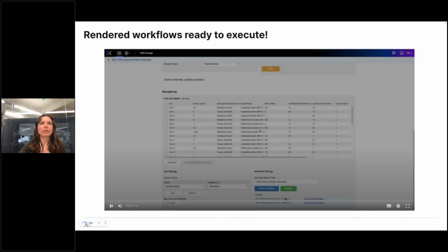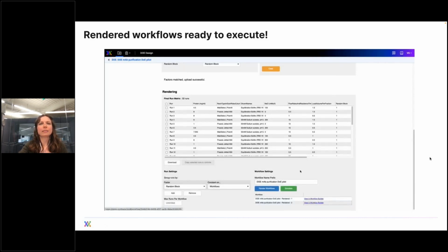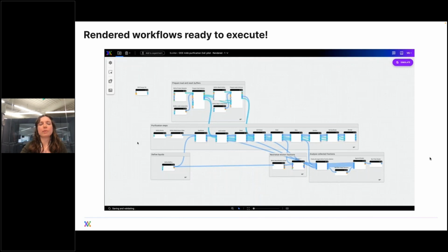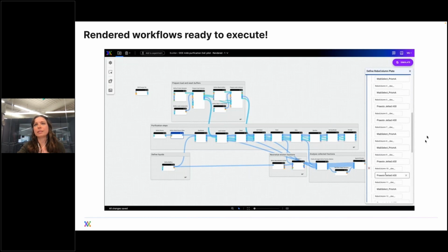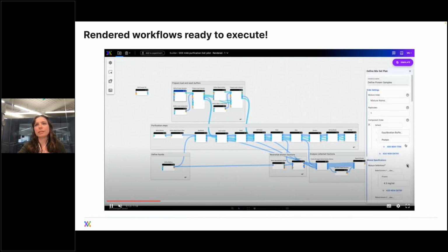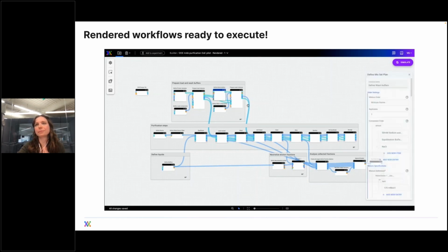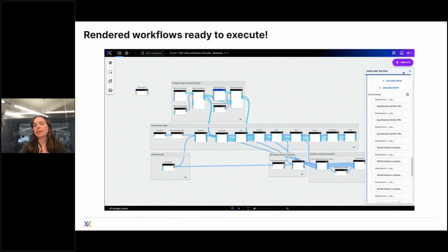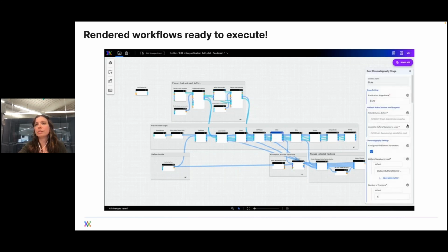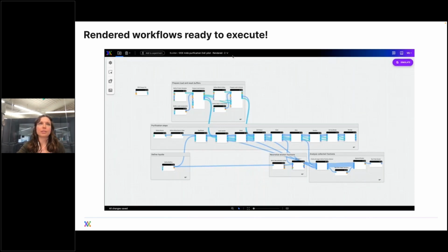And so here I'll quickly showcase how this looks. So again, we get taken to the builder and you see the workflow looks exactly the same, but now you can see that all the parameters are automatically filled in. So you didn't have to do this manually. Synthace imported this from the design file. And that there, it's basically columns 1 all the way through to 16. And we're highlighting here the different stages that we decided to DOE.